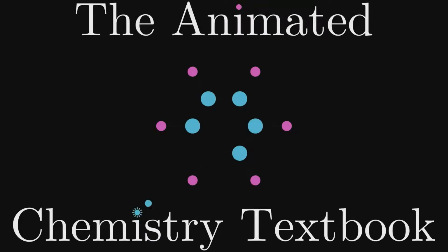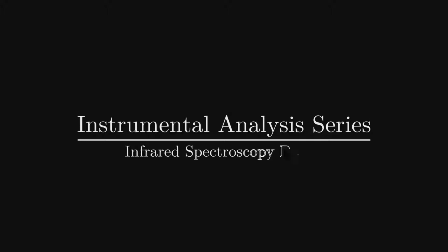Welcome, fellow chemists, to the second video in the instrumental analysis series on infrared spectroscopy. In this video, we will focus on the variety of carbon-hydrogen bonds. Like in the video on functional groups, you'll get a chance to use your new knowledge on two practice spectra.